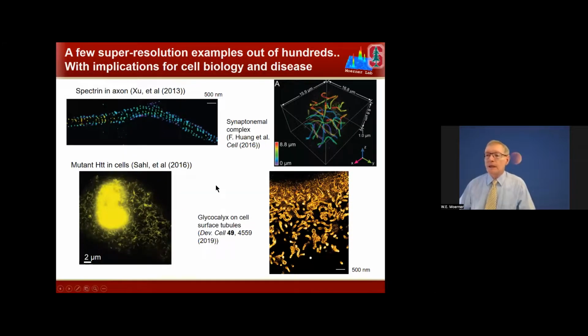In the years since, in the last few decades, many researchers all over the world have been using these ideas to observe new structures inside neurons, new behavior and structures of the DNA inside our cells, fibrils that come from diseases like Huntington's disease, sugars on the surfaces of cancer cells. That's what all of these yellow structures are coming from, and they form tubules. The cell itself forms tubules, and many, many others. It's a very exciting time to be able to see much more detail.